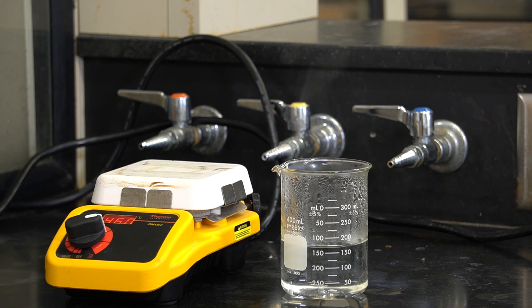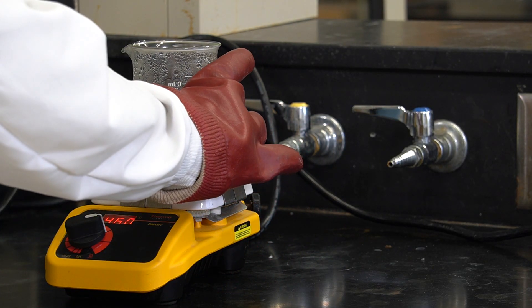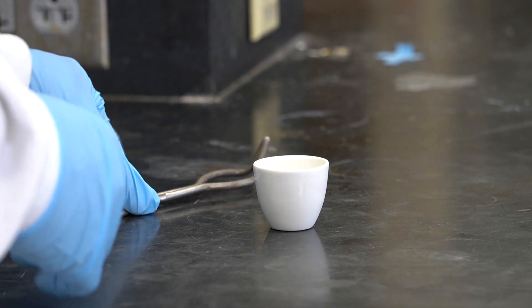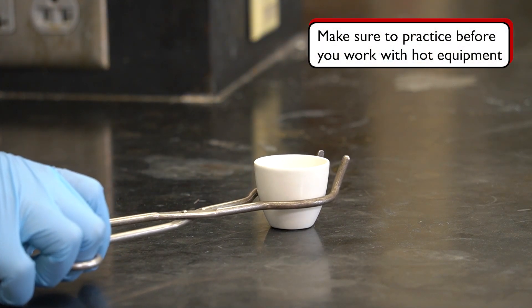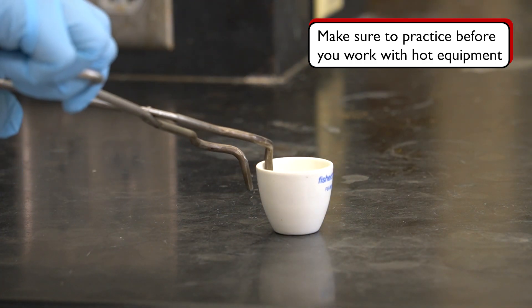What is the best tool to use when handling a beaker that contains a hot reaction? As the beaker is large and heavy, the safest option is to use a pair of insulated heat-resistant gloves. After picking up the right tool, practice with it before handling hot glassware — it's like rehearsing for a show, preventing mishaps and keeping things safe.